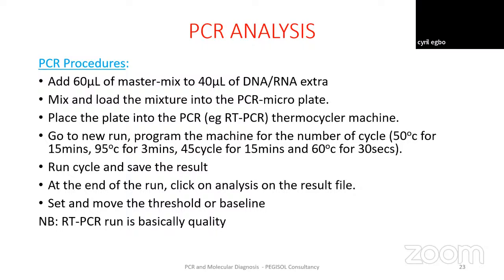So the primer will now be added either at 5' or at 3' to make it amplify to DNA before denaturing it to release the strand to form a single strand, so that another annealing may occur that will attach to the first strand.